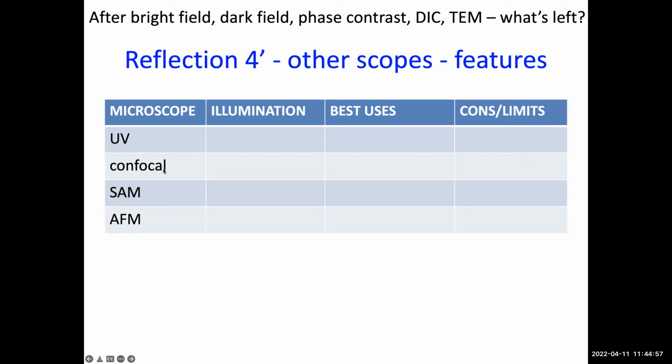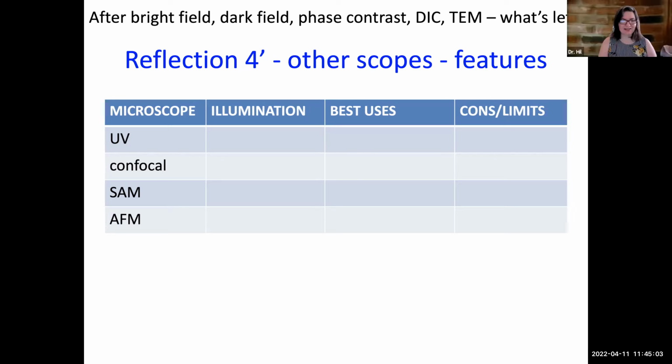I was going to say the laser as well, but also it's good for subcellular imaging. Yes, exactly. And then it can provide a live time lapse. Yes, that's right. Live imaging is better than UV because the laser is more targeted, so it takes longer to cause damage. And time lapsing is a common way we use that for that reason. We can go over time and look at something alive.